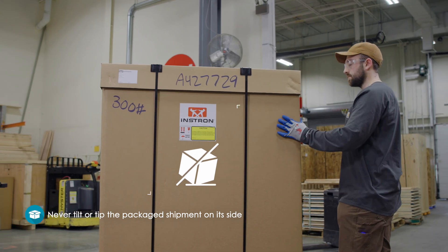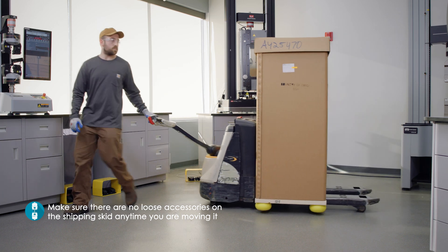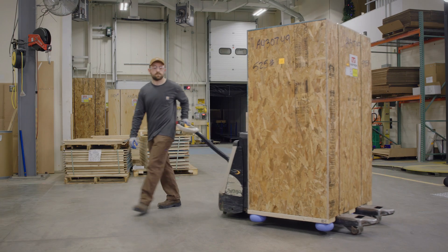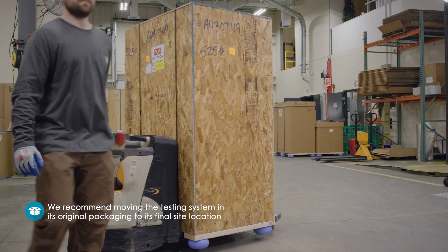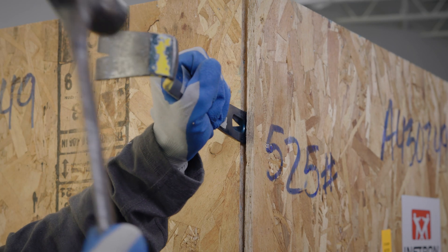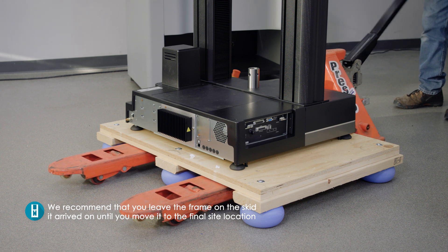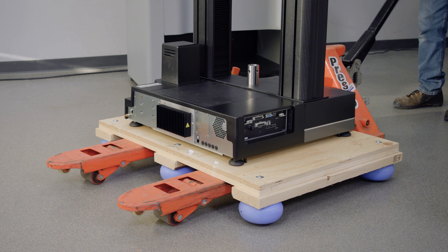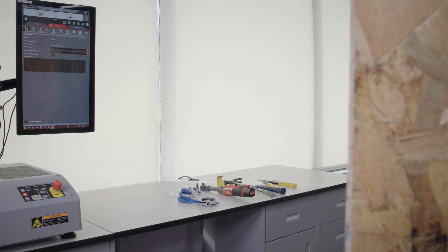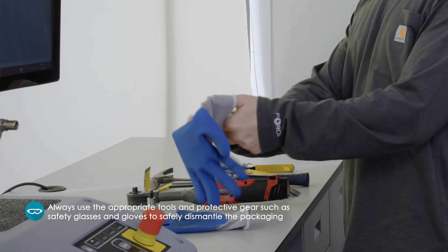Never tilt or tip the package shipment on its side. Lastly, make sure there are no loose accessories on the shipping skid any time you are moving it. If your site can accommodate, we recommend moving the testing system in its original packaging to its final site location, or you can dismantle the packaging wherever space allows. In either case, we recommend that you leave the frame on the skid it arrived on until you move it to the final site location. And remember, never lift or move the system in a manner not listed in the pre-installation manual. Always make sure you use the appropriate tools and protective gear, such as safety glasses and gloves, to safely dismantle the packaging.